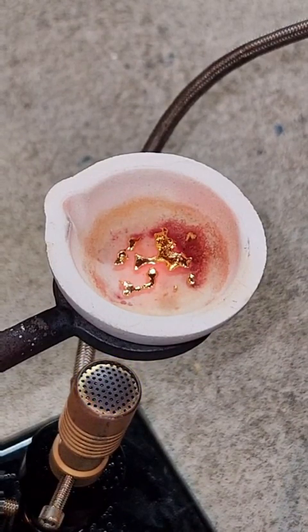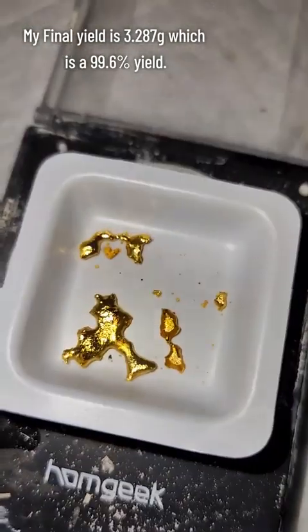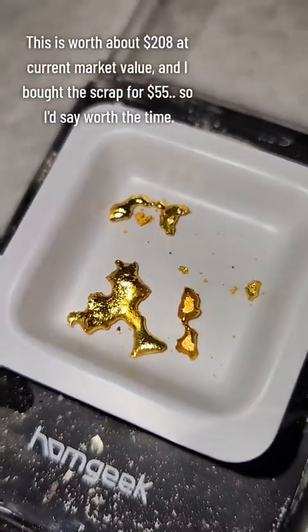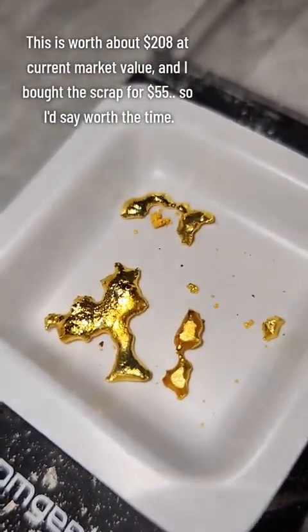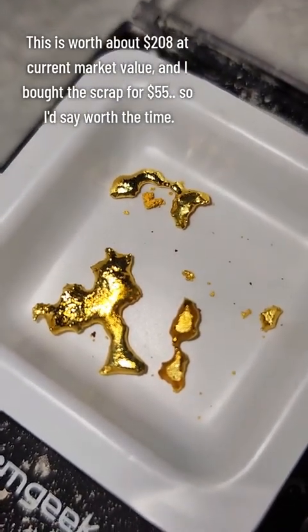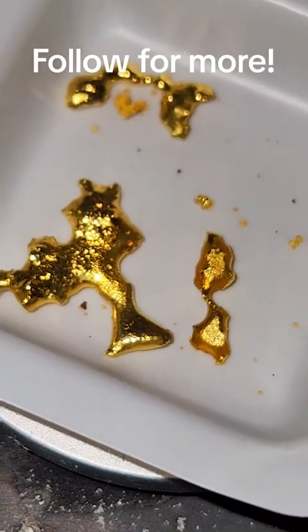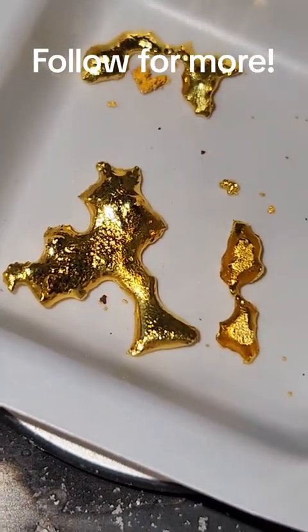My final yield was 3.287 grams, which is a 99.6% yield. I typically don't bother trying to get high yields on this channel because I'm doing it for fun, but this amount of gold is worth $208 at current market value, so I wanted to get all that I could out of it. I hope you found this interesting or at least informative, and if you'd like to see more science, consider giving me a follow.